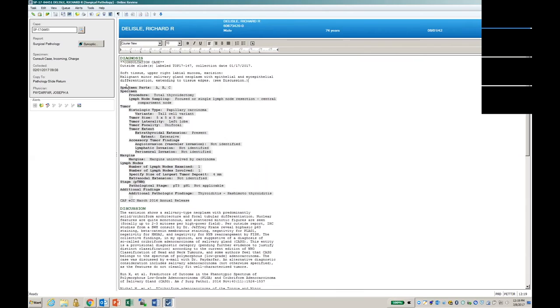So this is what it looks like. Our reports, once we verify them, actually go across to our clinical Epic, and you can view them in a PDF format in Epic, which is our own interface here. It actually looks really nice from that standpoint. The bolding and the formatting stays with the text. And I think the readability is pretty slick. But that's really what it boils down to.